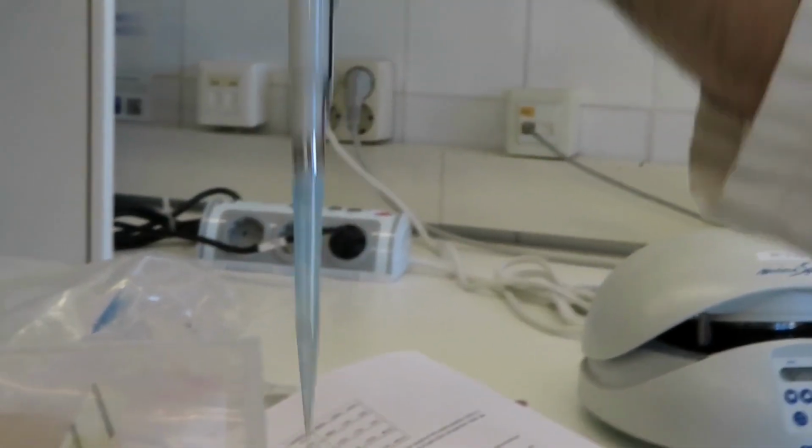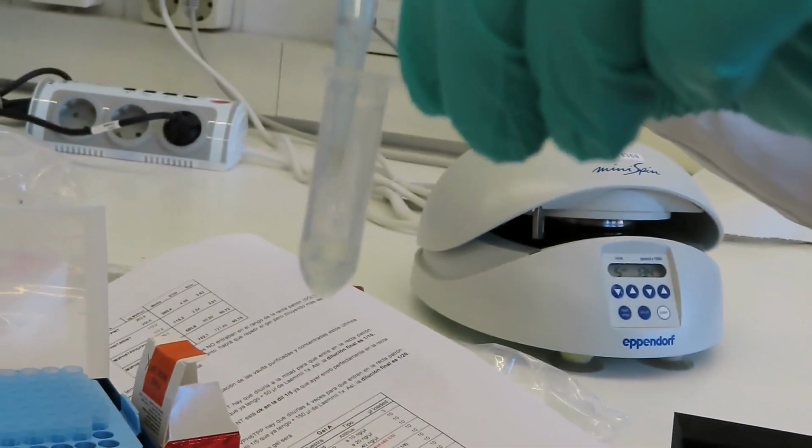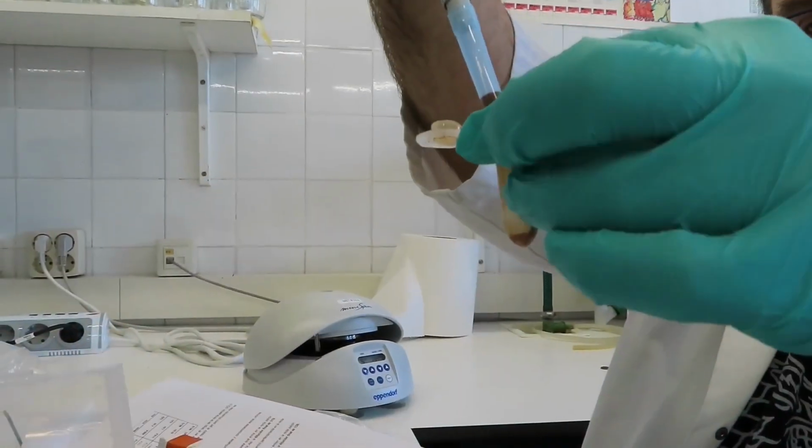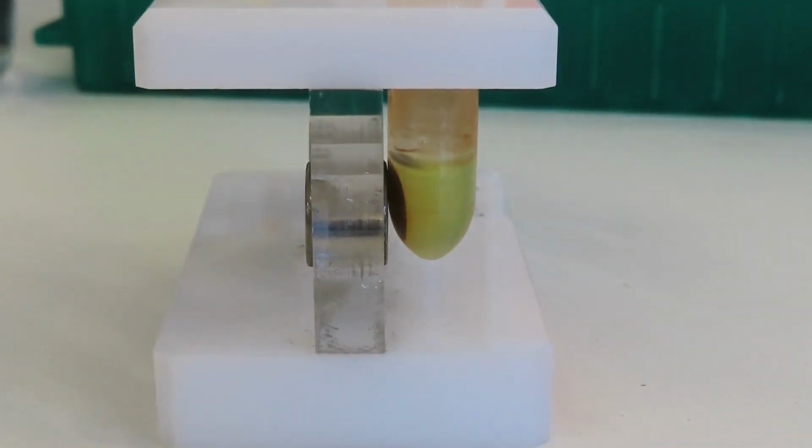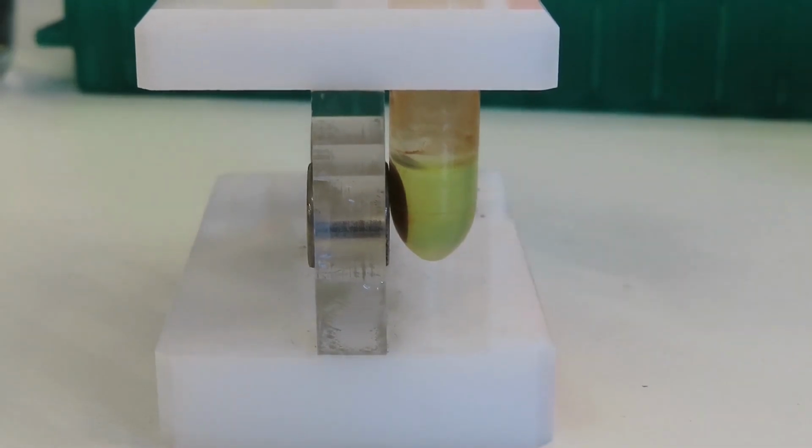This is the flow-through. Observe that the remaining sample has lost the green color, suggesting that the GFP protein has bound to the beads. Several washing steps are performed to remove unspecific proteins bound to the beads. In this case, some greenish coloration of the sample can be seen, indicating that some GFP proteins were weakly attached.